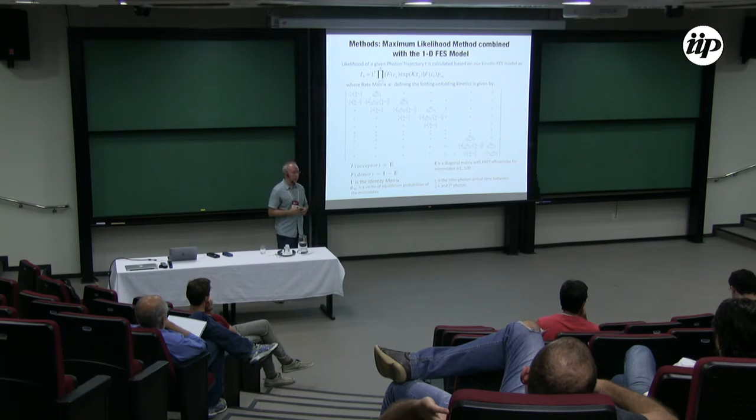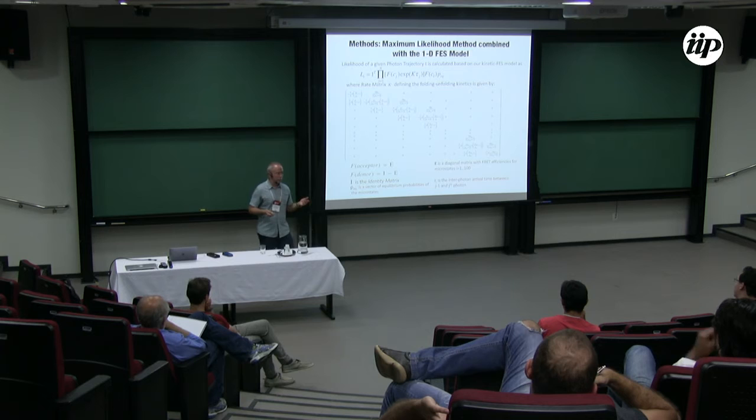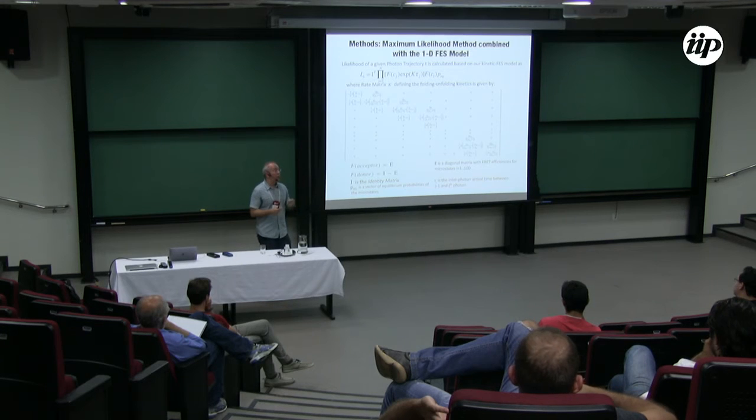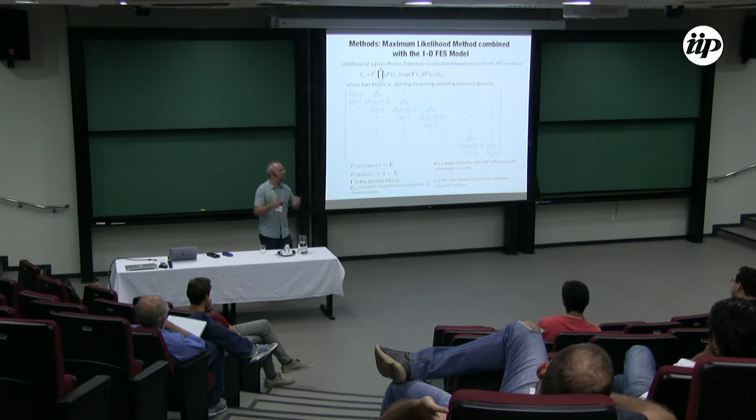Yeah, I mean, with this type of experiments, it will be very hard to do. I think you can do that much better with mechanical unfolding. Yeah, it has other caveats and it has other advantages. So in one case, you have these big fluorophores, these photon statistics. In your case, you are obviously tethering the molecule and pulling in one direction. But in that case, it's much easier because you could actually be recording. Here, it will be very hard to do.